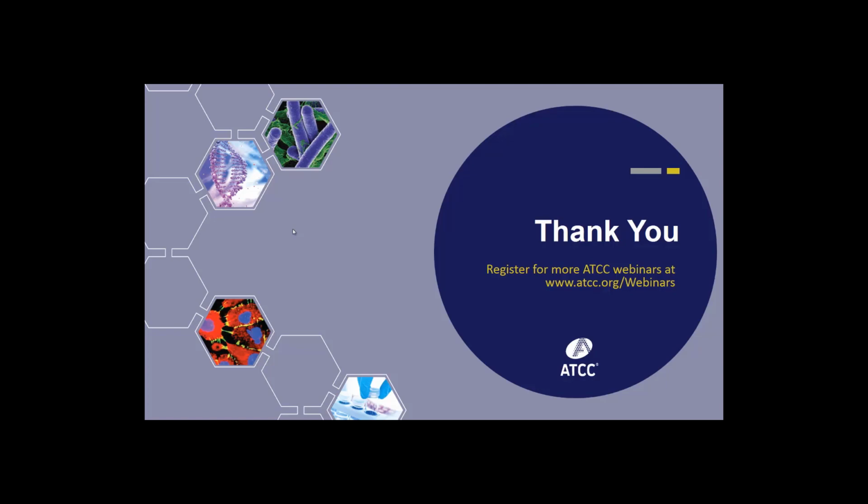There is one slight limitation to this type of analysis, and that is that the whole genome sequence of the type strain must be available to compare to. But as long as that type strain, for example E. coli, is available, you can take the whole genome sequence of any isolate and determine whether it falls within the circumscription of the type strain of E. coli. Here at ATCC, we're beginning to use this type of whole genome analysis to identify some of our organisms, and this allows us to apply the most modern whole genome methods to the characterization and authentication of our material.